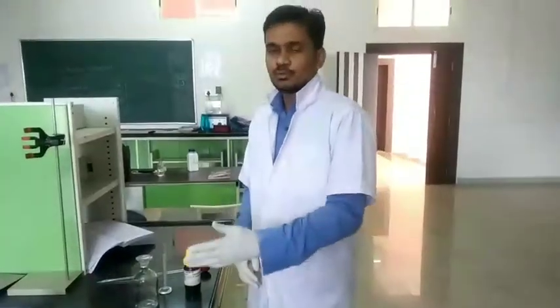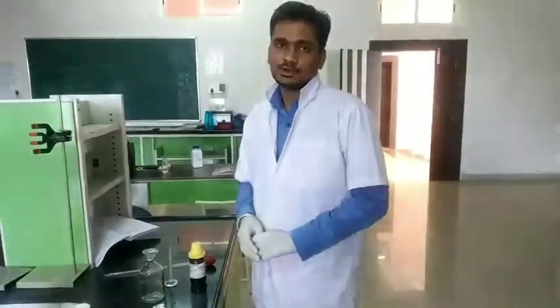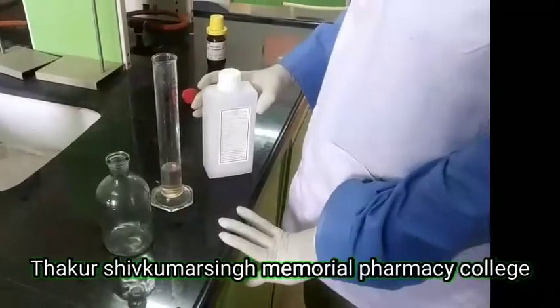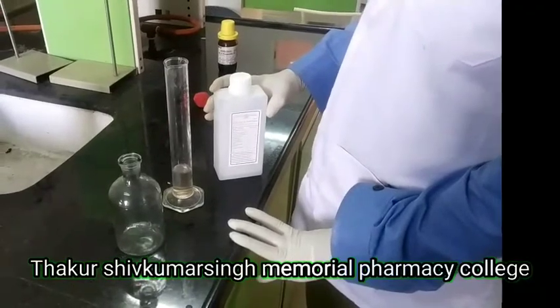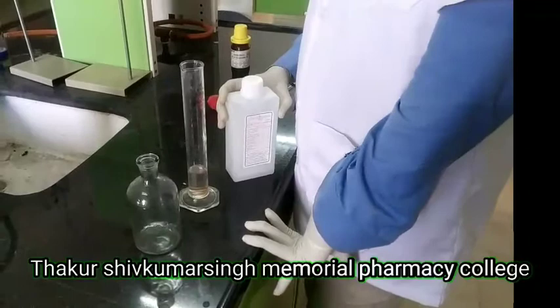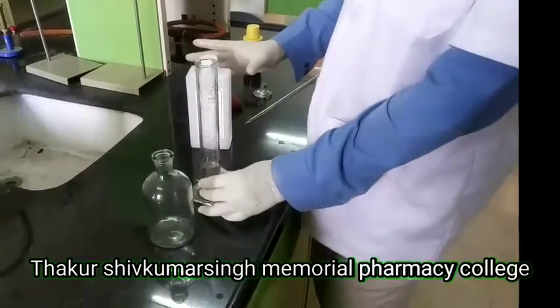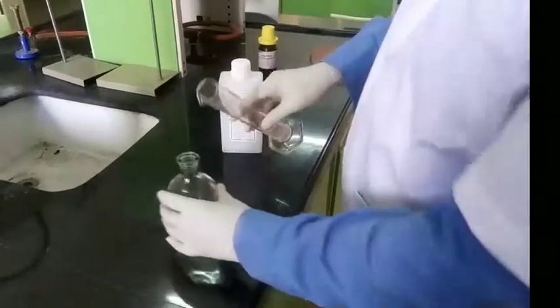Let's see the procedure. For that, we will take a measured amount of peppermint oil and dissolve it into 30 ml of ethanol. Now the given formula is for 100 ml, but we will take 50 ml instead of 100 ml. So all the quantities given in the 100 ml formula will be half. So here we will take 30 ml of alcohol. We will transfer it into the reagent bottle.